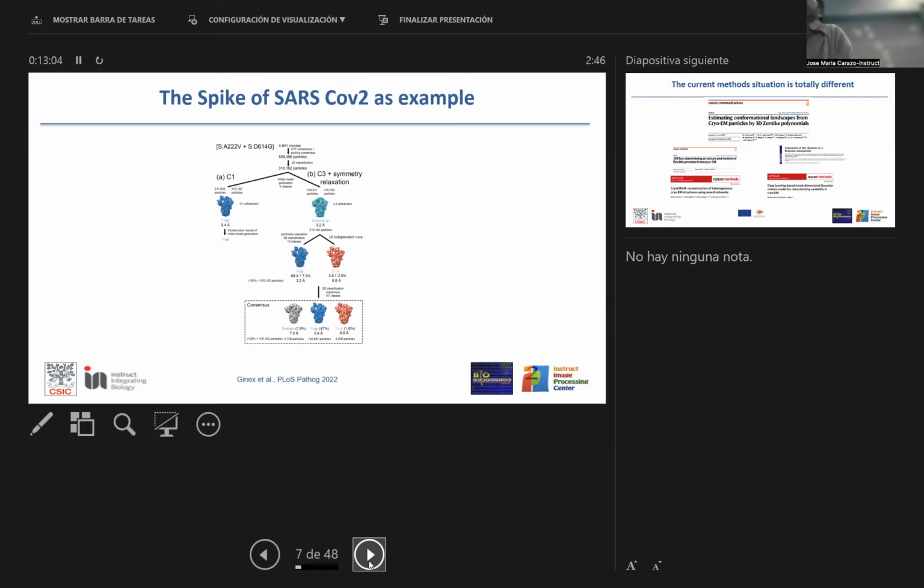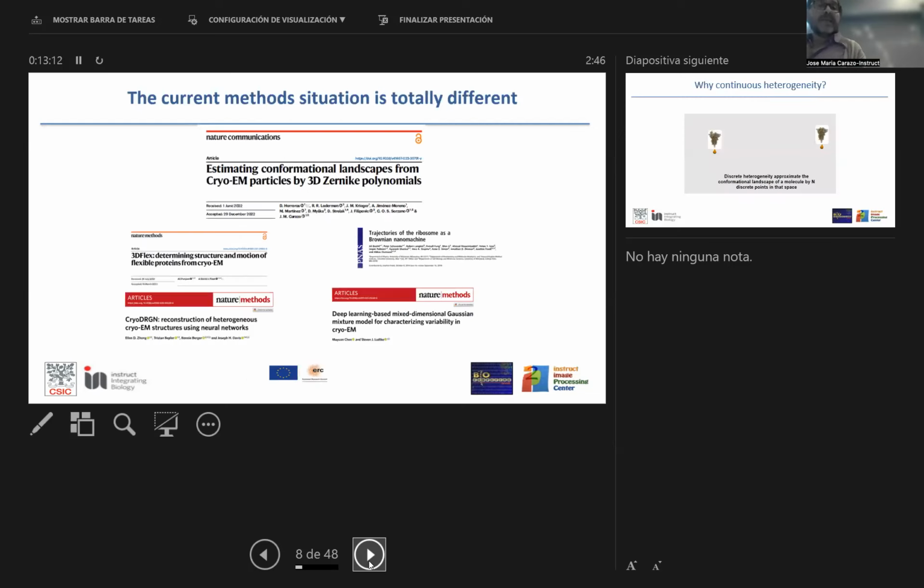It's going to give you problems because algorithmically, we are not modeling the reality in the right manner. And what we have been trying is to get rid of that. And really, when I say we, certainly my lab, but we are not the only people in the world. The situation in cryo-electron microscopy has changed a lot in recent years, in the last 2 or 3 years.